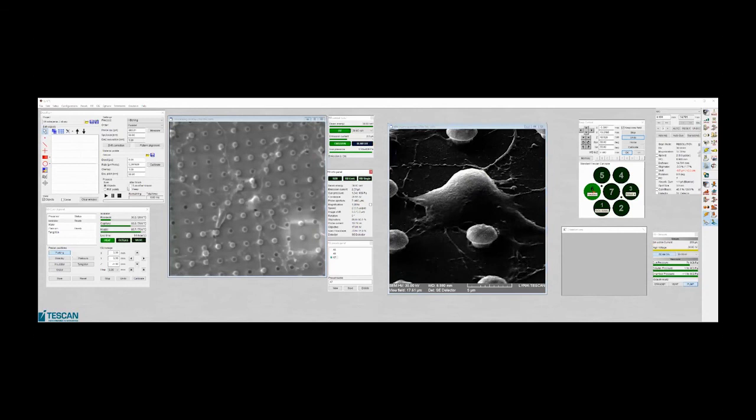So if you are interested only in one part of it, for example, like here, with or without protective layer, it's measured on your sample.